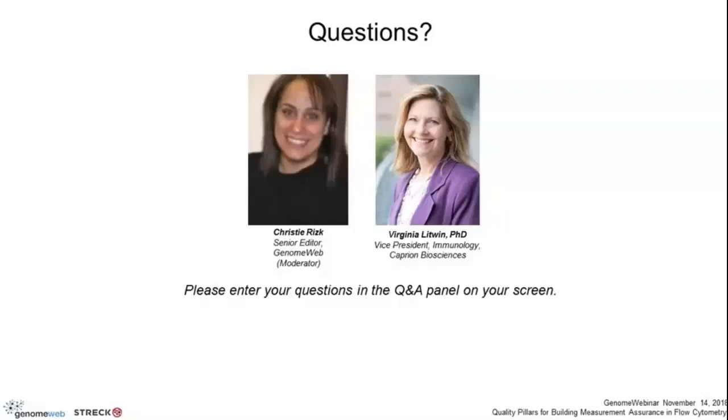And I think in the webinar from Sherry Green, she does address this. It's a long answer. No, please continue if there's anything else you wanted to add. No, basically the bottom line is you're going to try to have your instruments so that you can get a target value on all the instruments in the same space every time, the same place. So I would just refer you to the publication, sorry.